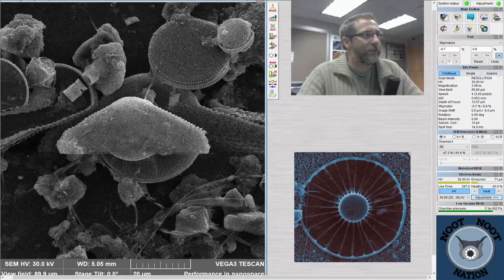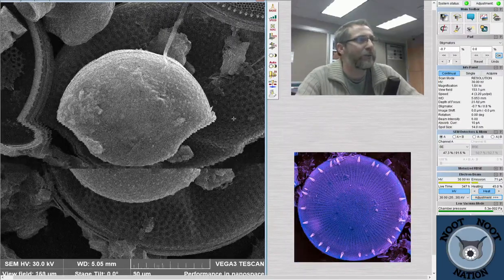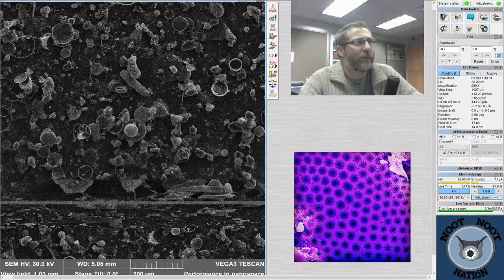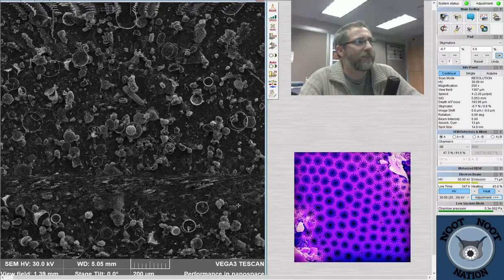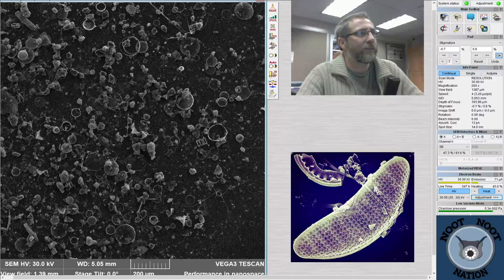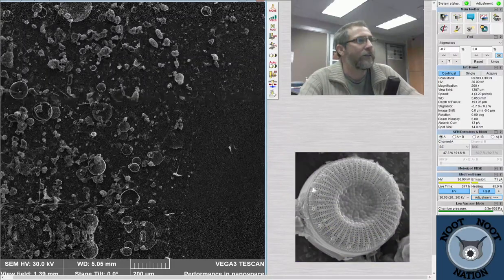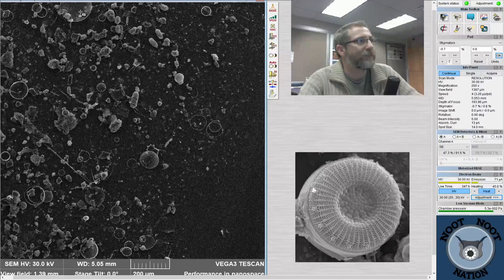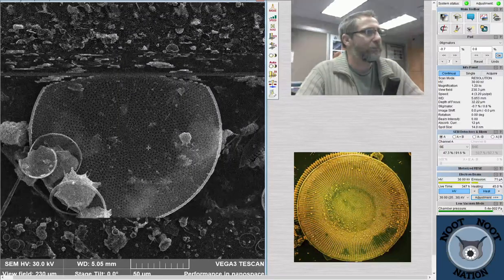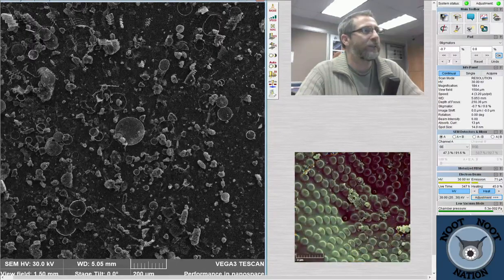This one's just got a Melosira or something sitting on it. Otherwise, it would have been beautiful. This is another problem with the SEM. In my lab, I have a micromanipulator, but we still haven't got the right tools to use it perfectly. I was going to put a student on that one of these days and just never got around to it because we got shut down for COVID stuff in the spring of this year. Can't say that for much longer. We're almost to the end of the year. And so as a result, it just had been sitting in my lab hanging out. But I bet some of these big marine diatoms would be easy to pick up and manipulate.